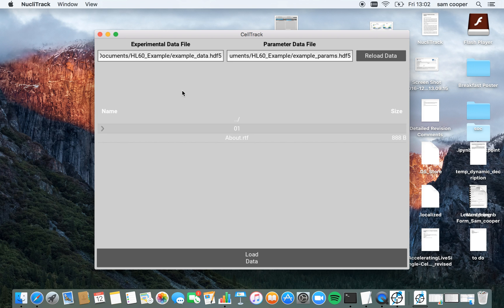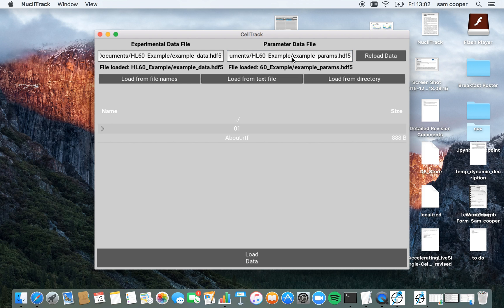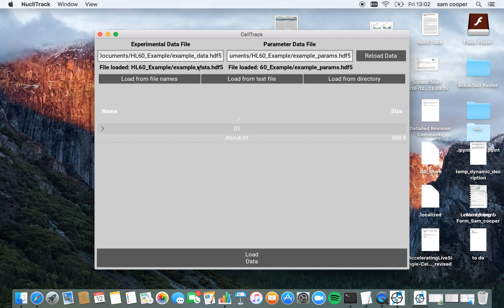Here I'm going to create these example data HDF5 files. There's also the example data and example parameter HDF5 files by clicking enter on each of the text inputs. This loads up two files for storing the data that describes both what's going on in the field and also the parameters which we can use for other fields.